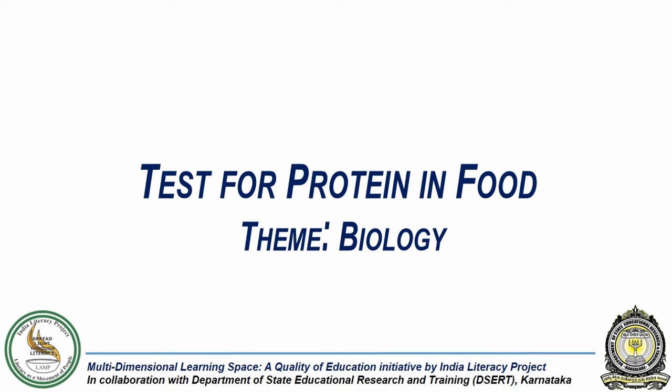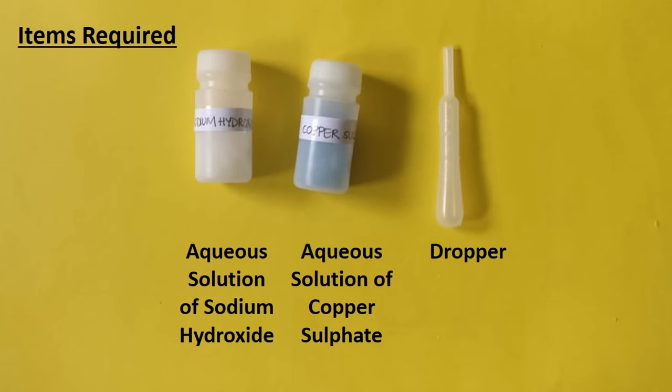In this experiment, we will investigate if there is any protein content in lentils or dal. For this experiment, we will need aqueous solution of copper sulfate, aqueous solution of sodium hydroxide, and a dropper.